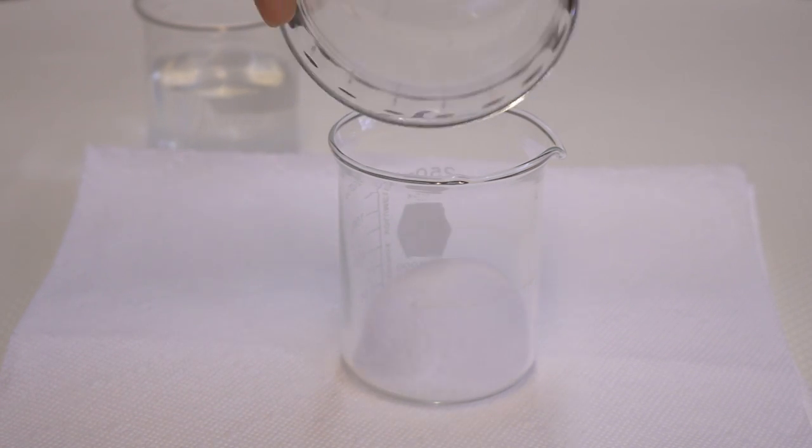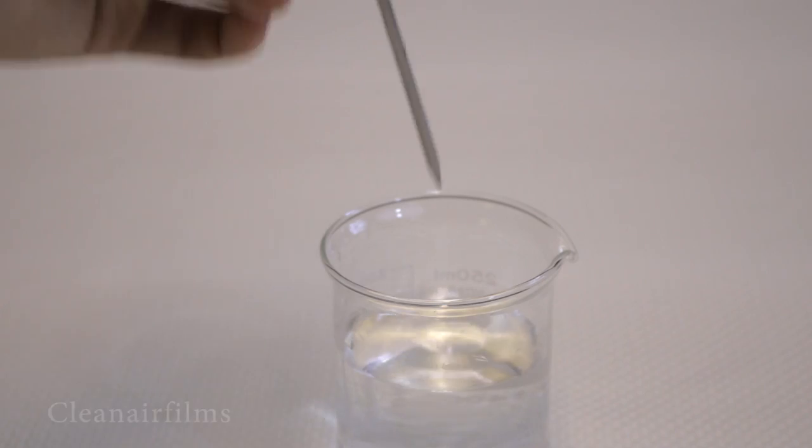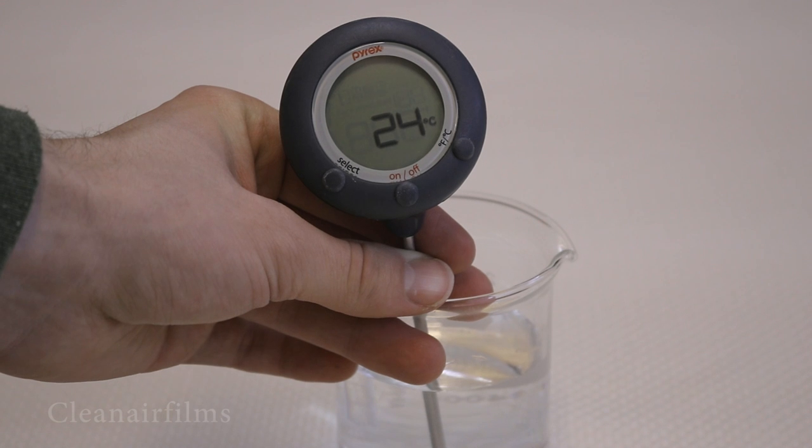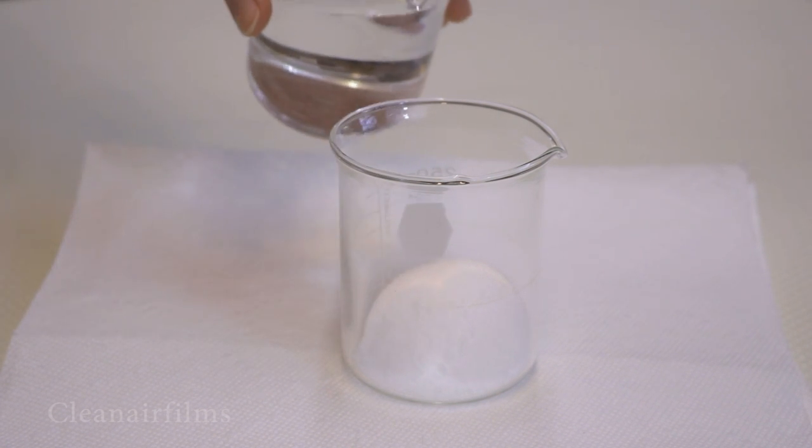We will start with about 30 grams of lye and place it in a heat-safe beaker. Our water is 24 degrees Celsius. Now I will slowly add the water to the beaker of lye.